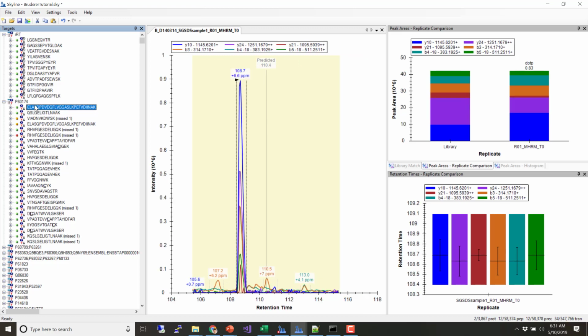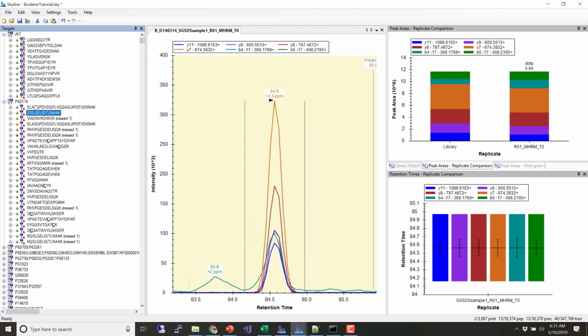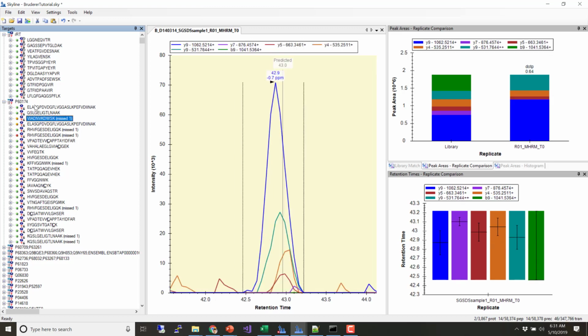Let's take a look at the peaks themselves. Press F11 and we can get in closer. That first one looks pretty nice. The second one, maybe there's some interference on this one transition. And you can pretty quickly go through everything.